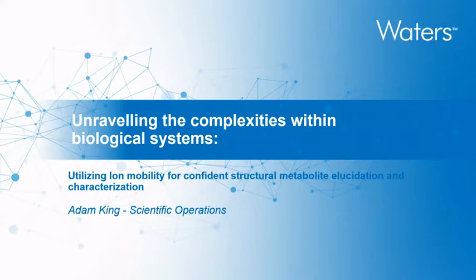Good afternoon, everyone. My name's Adam King, and I am a senior scientist for Waters, based just outside Manchester, and I work within the scientific operations department, focusing on metabolomics. So today I'm going to focus on ion mobility and how using ion mobility can help unravel some of the complexities that we all encounter within our metabolomic studies, and how that can help fully understand some of the molecules that we're looking at.